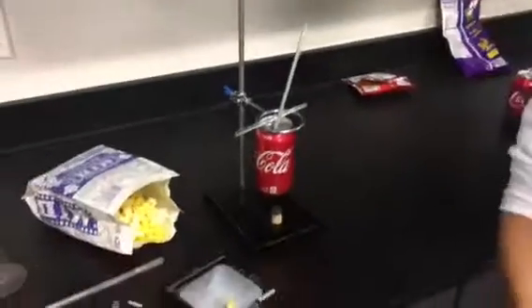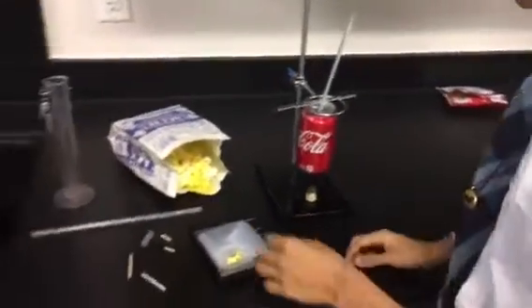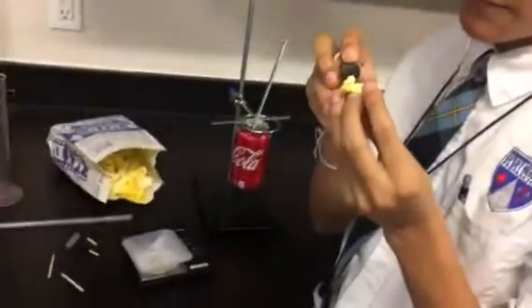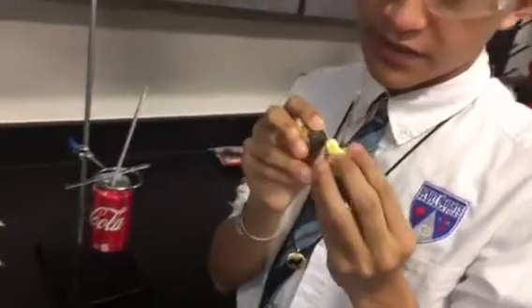21 degrees Celsius? Yes, ma'am. No, you leave it in there when you read the temperature, because you're measuring the temperature of the water, not the air. Now, put it more in the center.